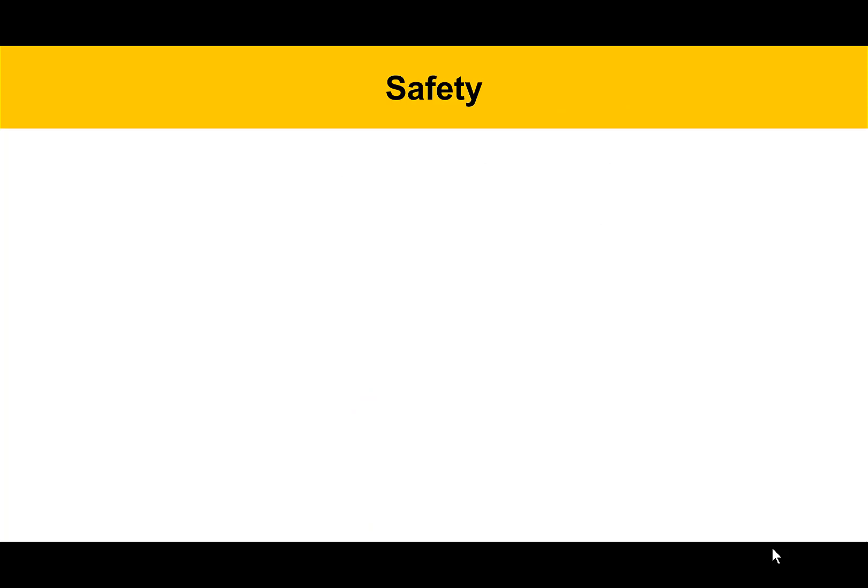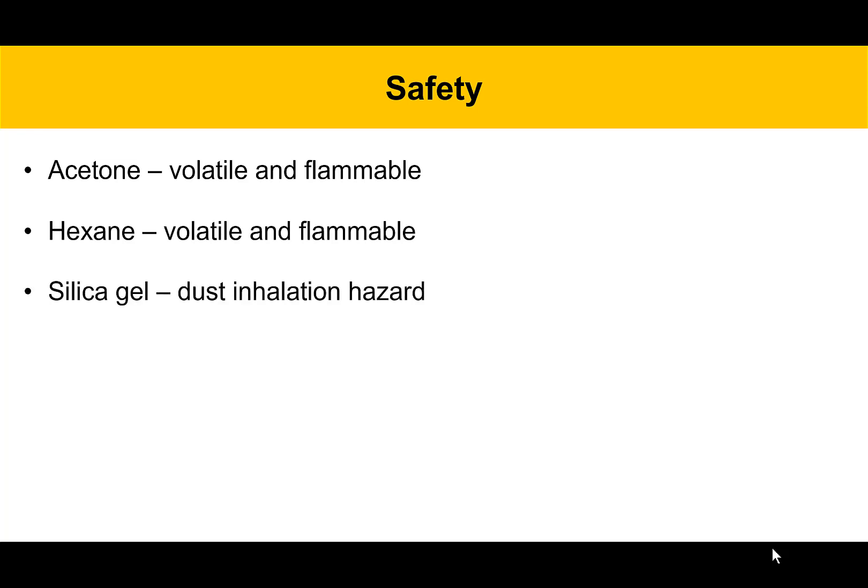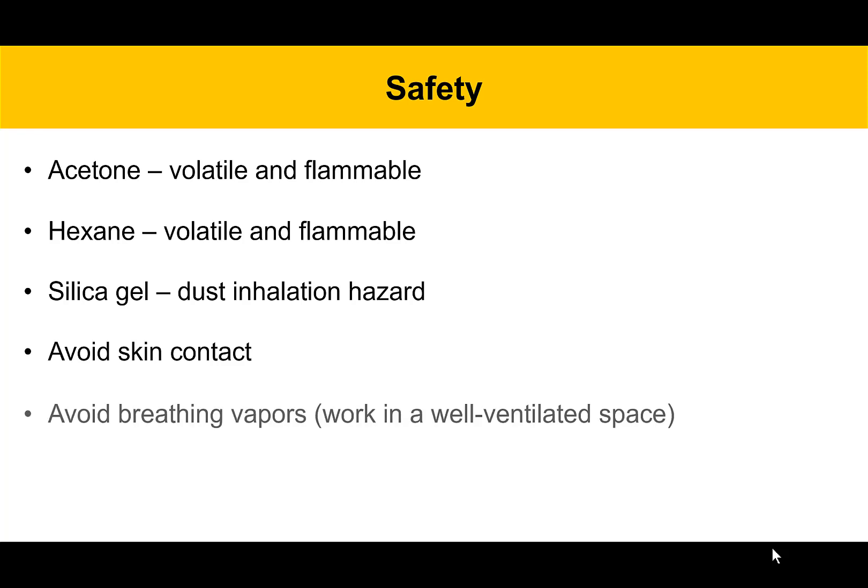Some safety items for today include: we're going to be working with the solvent acetone, which is volatile and flammable. We're going to be working with hexane, which is also volatile and flammable. We've got silica gel, which is a dust inhalation hazard — you have to make sure you don't get that in your lungs. You want to avoid skin contact with all of these reagents as much as possible, and also avoid breathing the vapors, so you're going to work in a well-ventilated space.